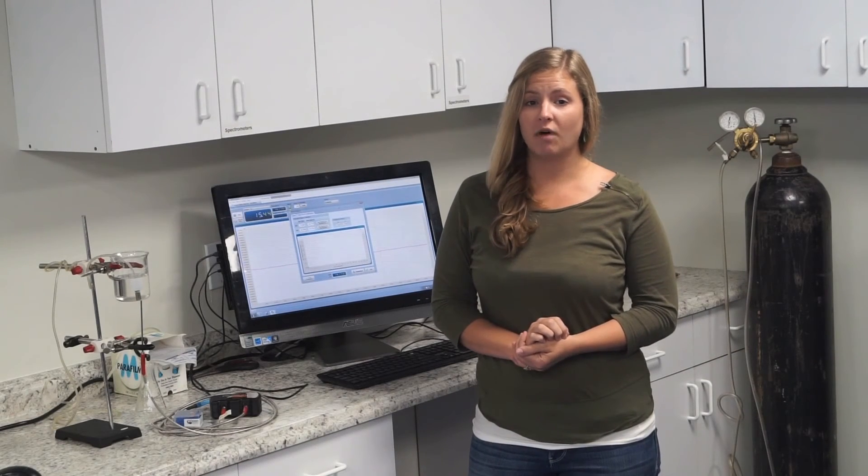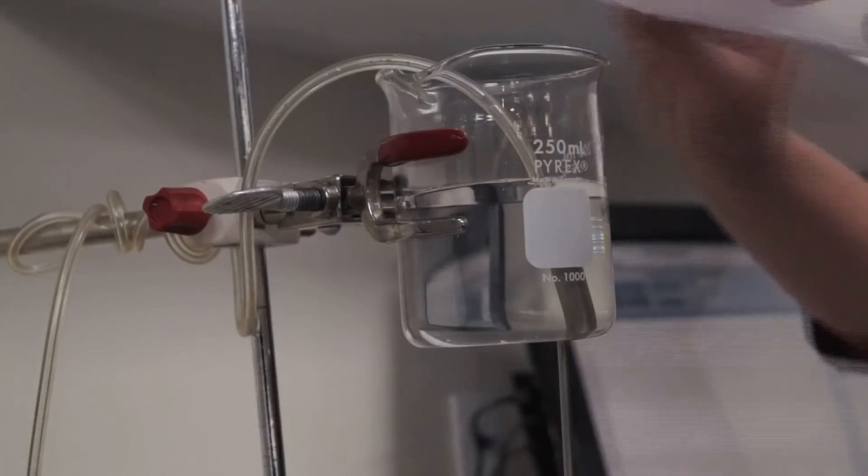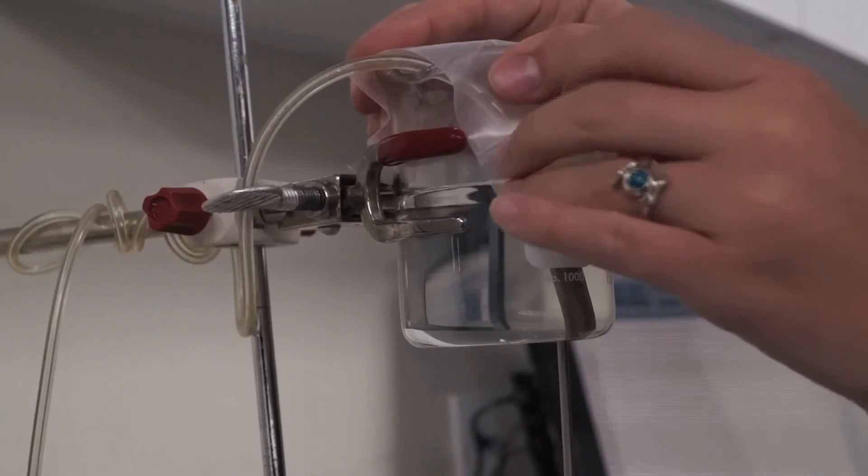For your zero percent oxygen point, you're going to need to purge your sample liquid of all dissolved oxygen. For that, you'll need a diffuser and a tank of nitrogen. You also need to make sure that the vessel is airtight.